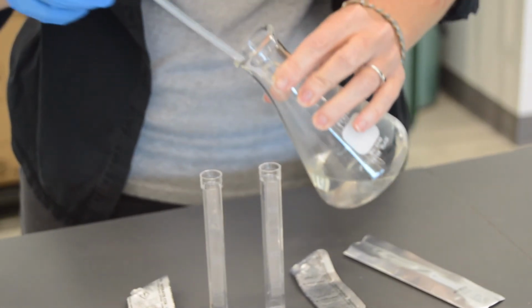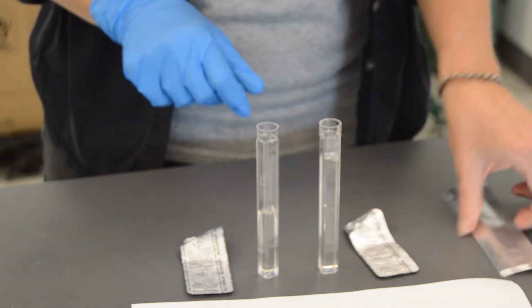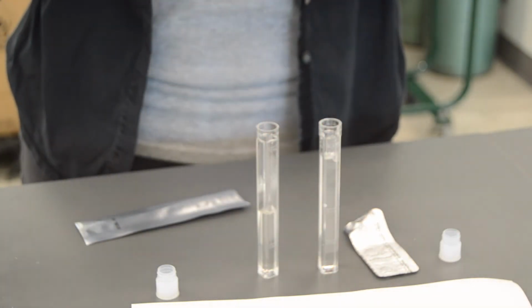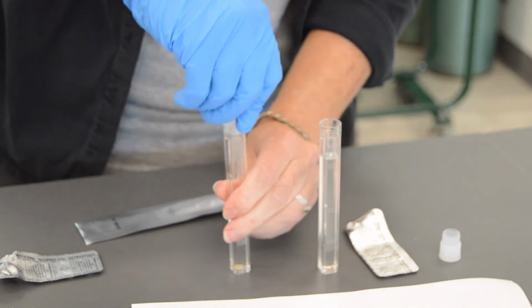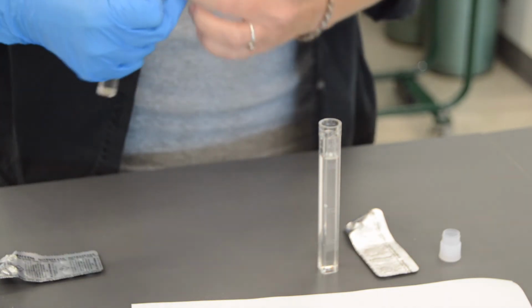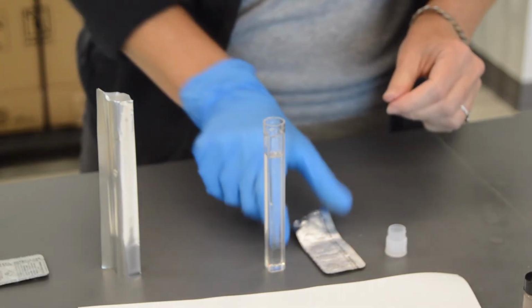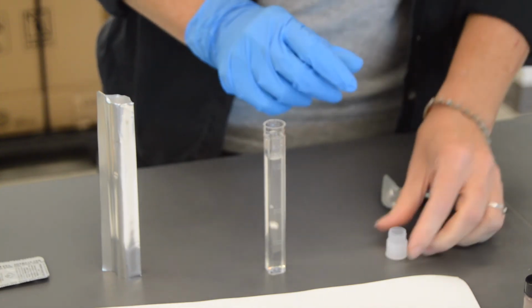All right, so now I need 5 milliliters for the nitrate test. And then we want 10 milliliters for the phosphate test. All right, so the nitrate test, I need my sleeve, caps. So we'll start with the nitrate first. It takes 2 minutes to dissolve the tablet. I'm going to cap it, and put it in the sleeve to protect it from light. I'll continue shaking that up some more shortly. And we'll go ahead and get the phosphate test started as well, because it takes a little bit of time to dissolve, and they both take 5 minutes to develop color.